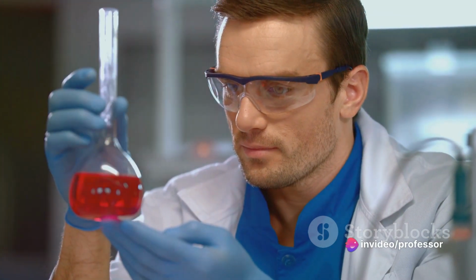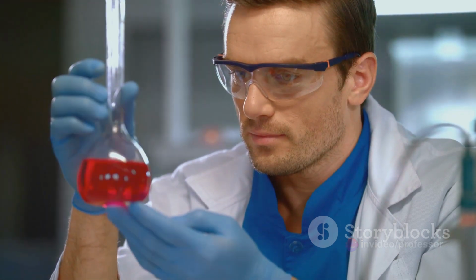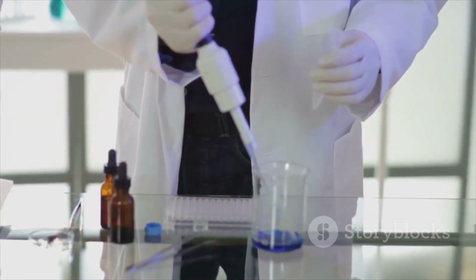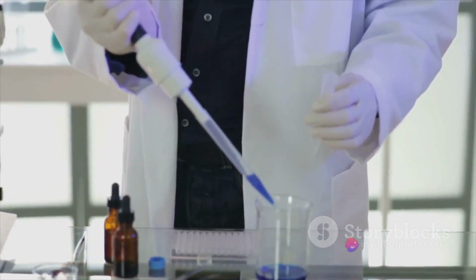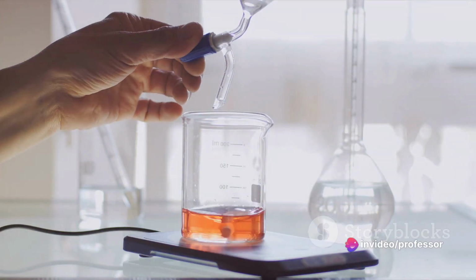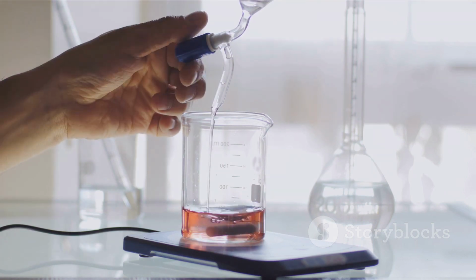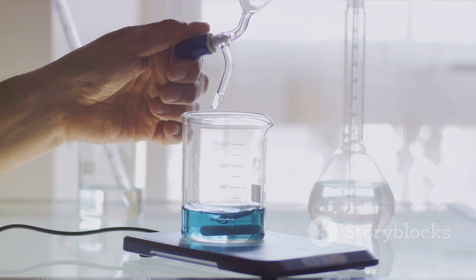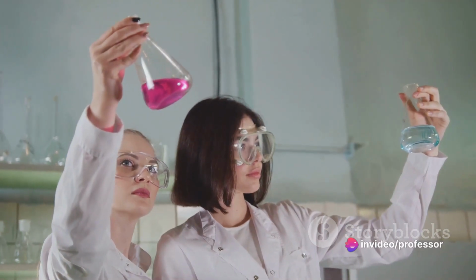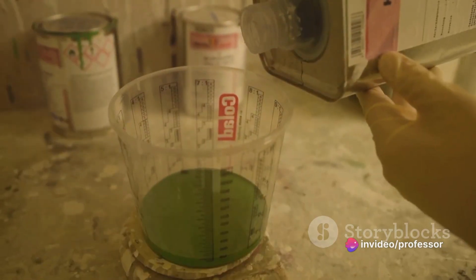It allows us to measure specific conductance, which is the conductance of a solution in a cell having unit length and unit cross-sectional area. Now let's delve a little deeper into the world of conductometry with conductometric titrations. Conductometric titration is a type of titration in which the electrolytic conductivity of the reaction mixture is continuously measured as one reactant is added. The point at which the conductivity changes dramatically is called the end point, similar to the color change in an acid-base titration.